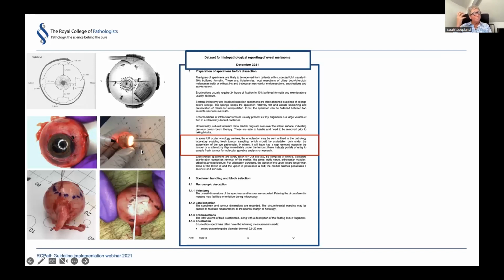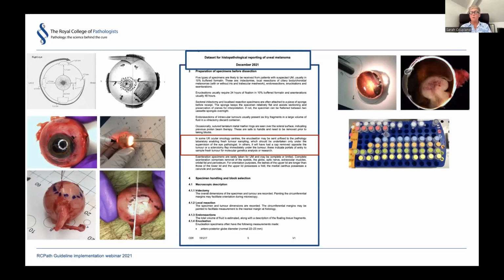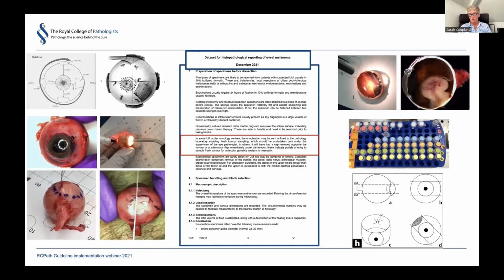So to highlight that, you do transillumination, you see a shadow in the area of the tumor, and when we cut open the eye fresh, we mark that area and then typically do what is called a pupil optic nerve parallel cut. This then reveals the tumor inside, and these uveal melanomas can be pigmented as shown here or unpigmented. And if you have the consent of the patient for either genetic testing or biobanking, then you can undertake this sampling and place the samples in the appropriate tubes.